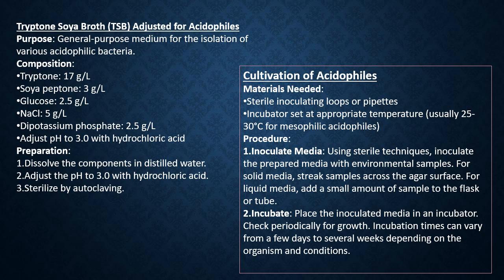You can also check directly with the sample. You can pipette out 10 microliters of the water directly onto a plate. You can do a spread plate and check what amount of microbes are present.